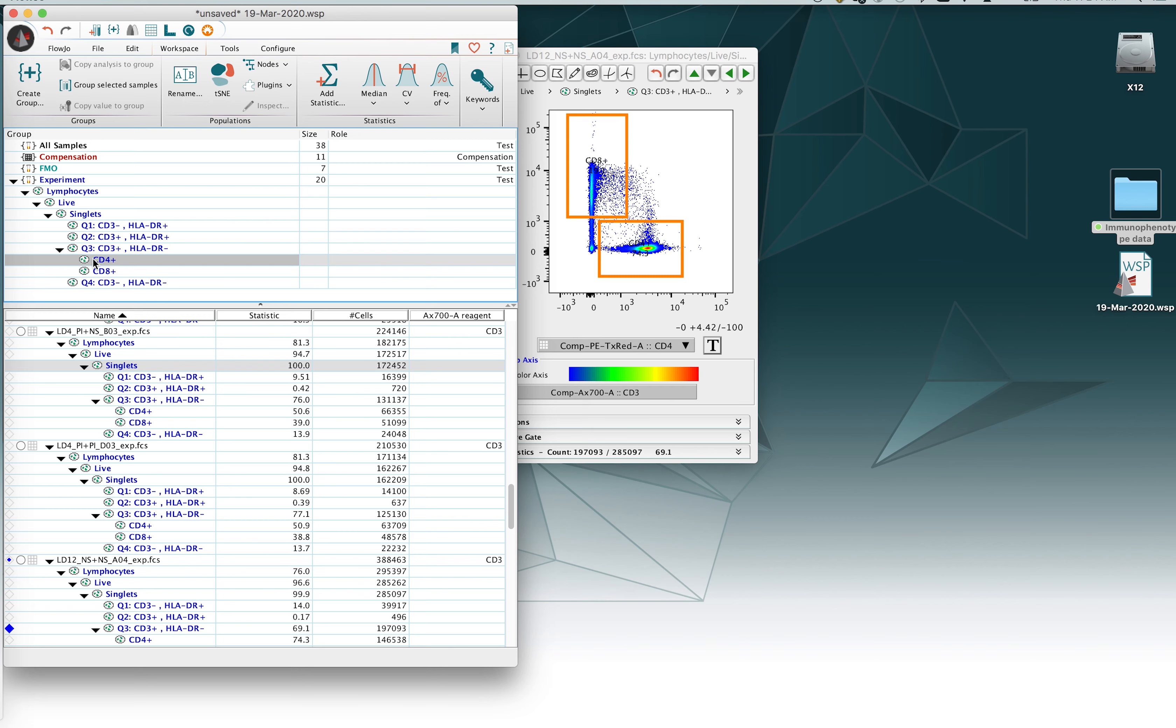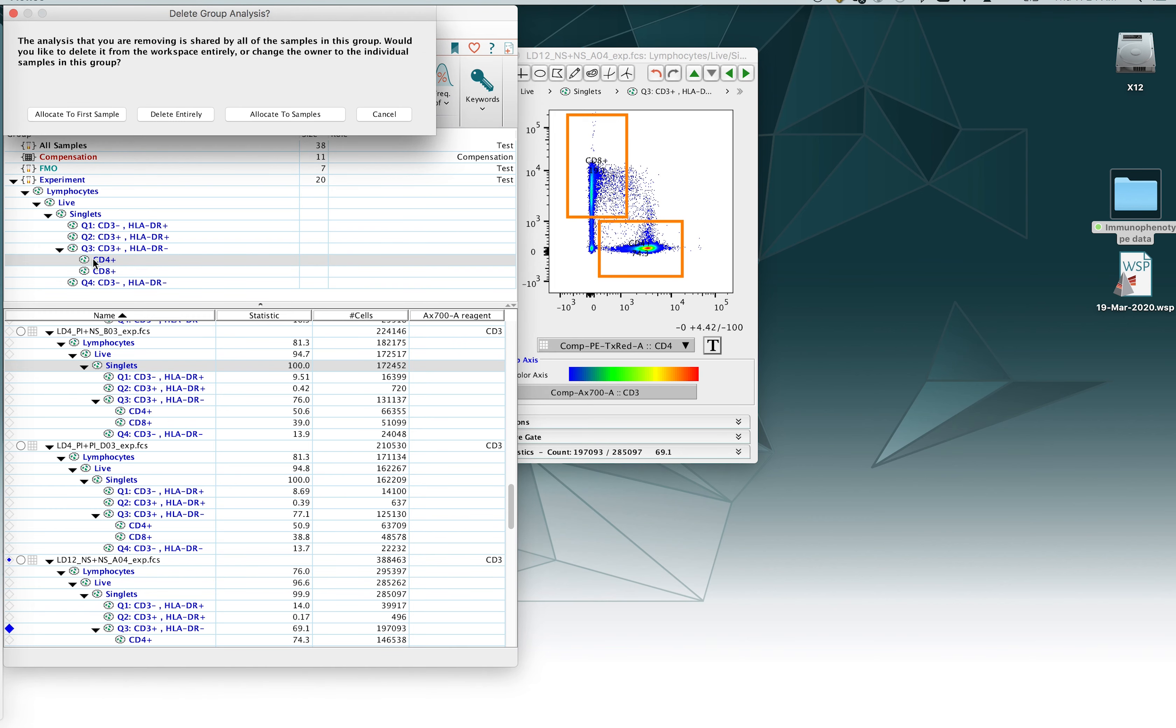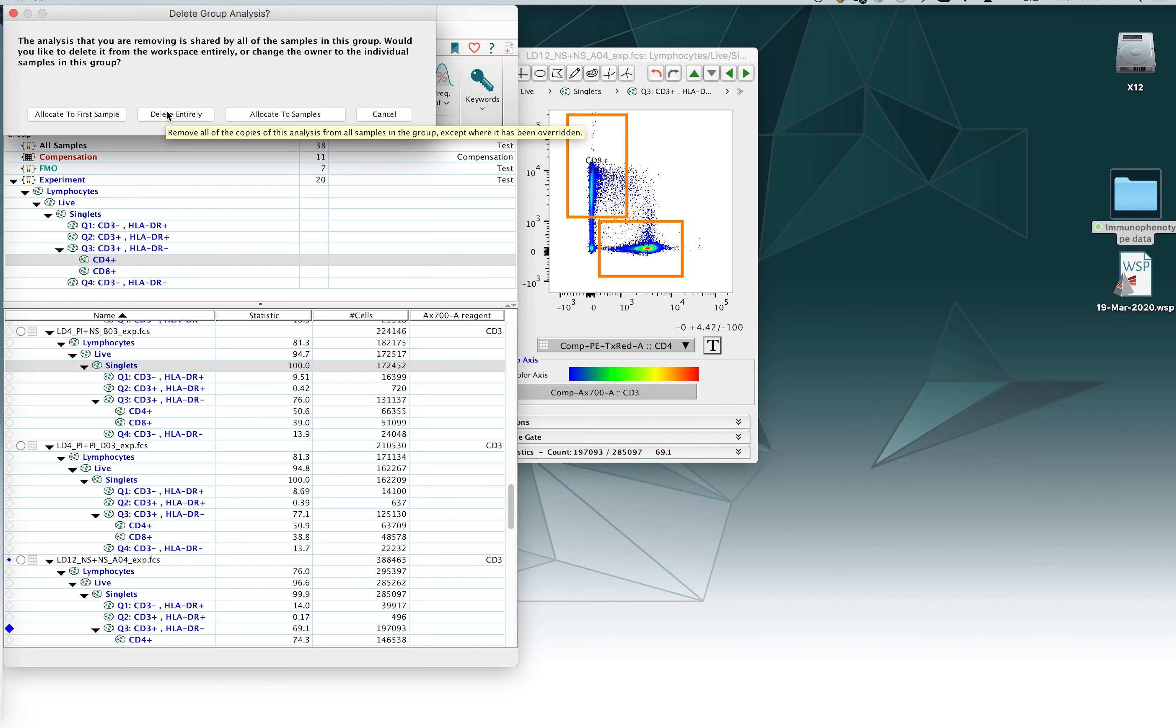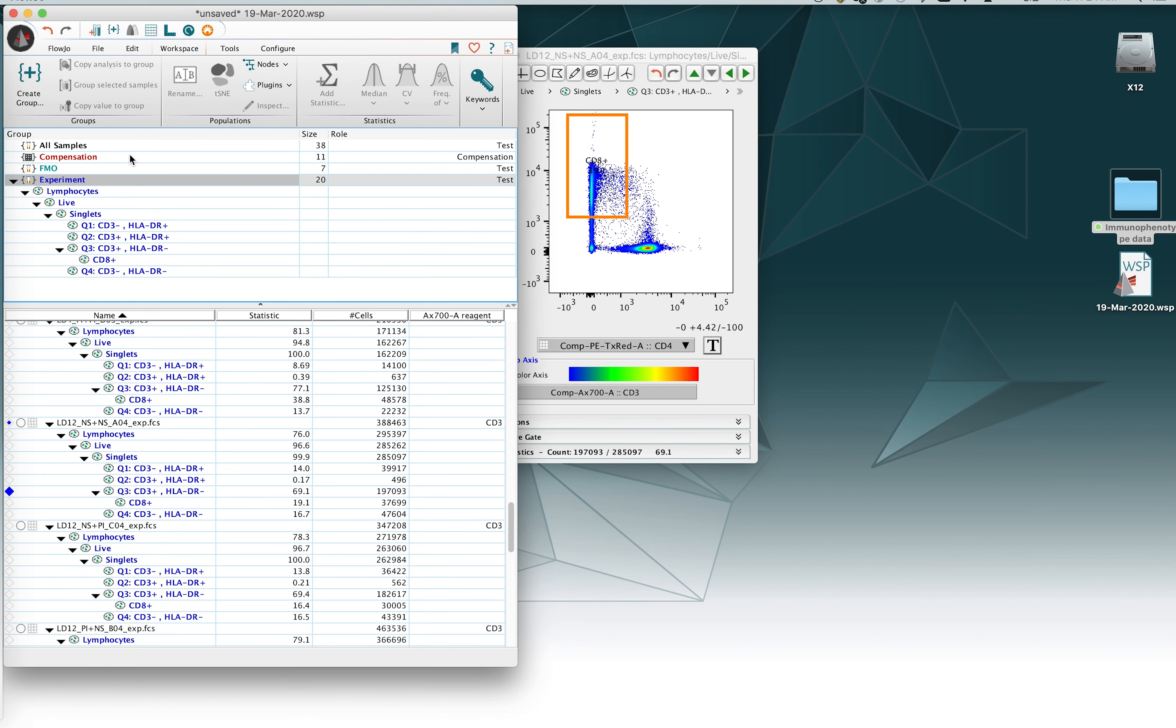So we select the CD4 gate here, then we hit the delete key. You will get an option here to delete it altogether, leave it on the first sample or leave it on all samples except delete it from the group. Now generally speaking, when we want to get rid of a gate, we want to get rid of a gate altogether. So I'm going to click the button here where it says delete entirely and this will remove it from the hierarchy as well as in the graph window.